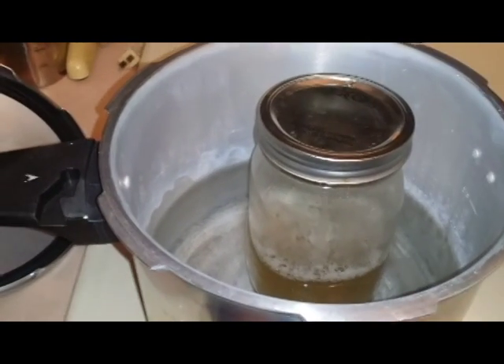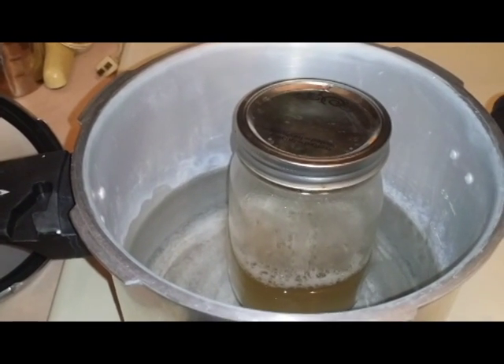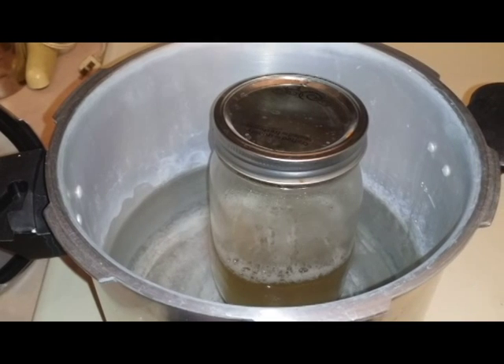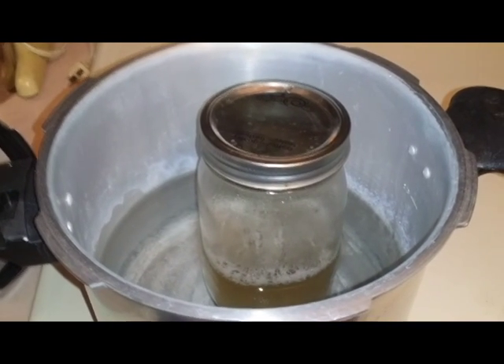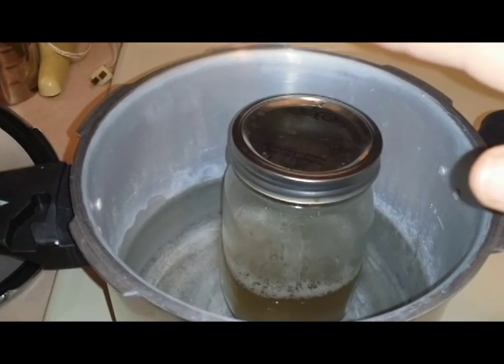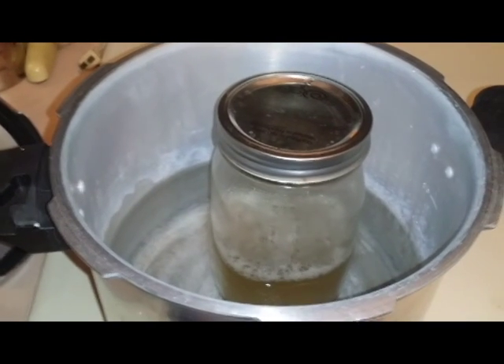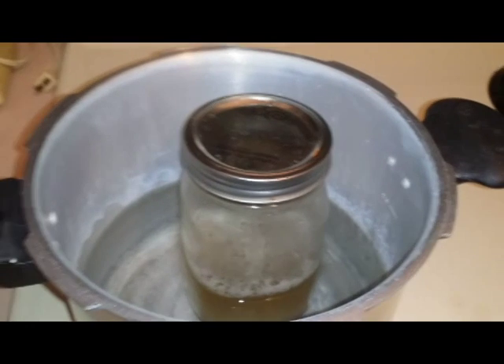You'll have to experiment a little bit with the level of water so you'll have at least 15 minutes of water to boil off while the pressure cooker is doing its thing. Of course, as per the instructions of the pressure cooker, don't fill the water up higher than the highest line — just defer to those directions.